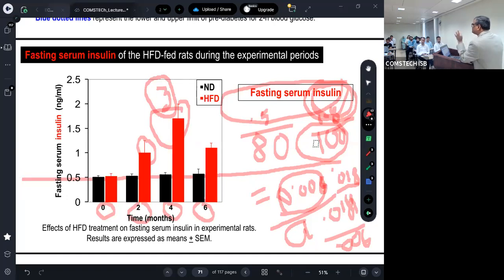It made a great paradigm shift in science and technology, because for the radioimmunoassay, you need a big laboratory and many things, like the gamma counter. But ELISA makes your life very simple. You need just an ELISA plate and an ELISA plate reader. It makes it very easy. So if you want to measure rat insulin, there are many kits available in the market, but you have to use a rat insulin kit.